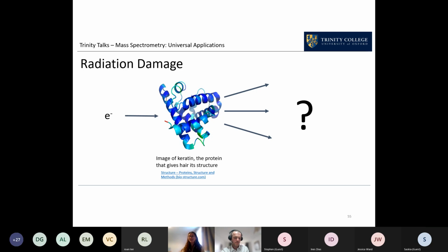That is a protein pictured there. I am not working on proteins with the kind of data that we get. If I were to put a protein in that machine, it would just fall into millions of pieces, and I would just get sort of this sea of stuff hitting the detector, and I would get no usable information from it because it would be way too complicated.